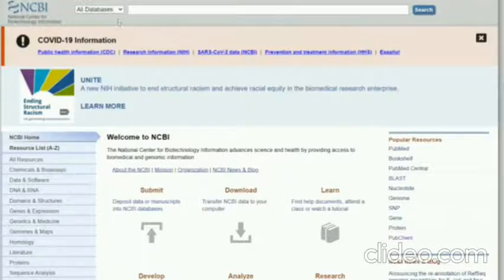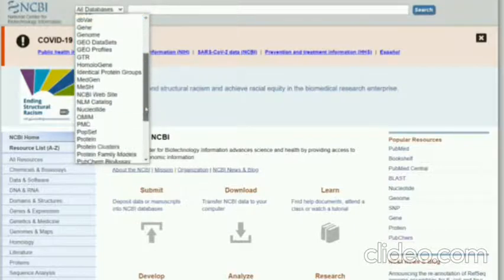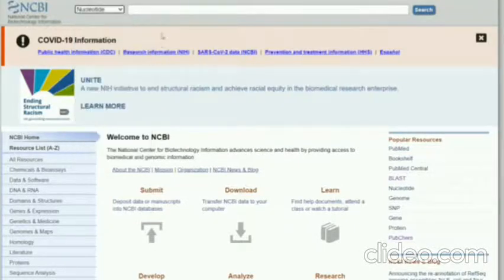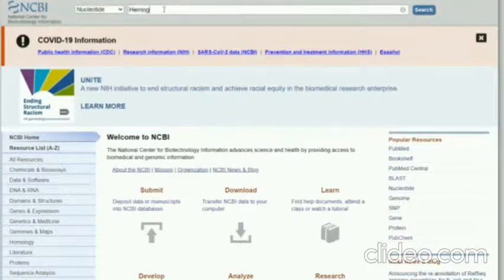First of all, you have to select here 'nucleotide'. Now I will search for an example: hemoglobin.